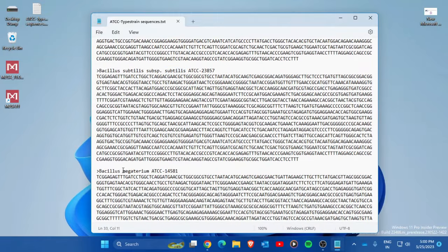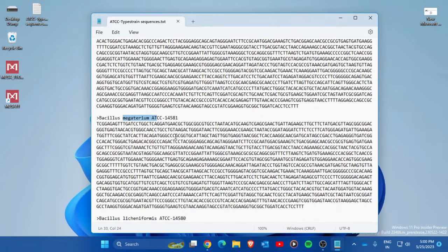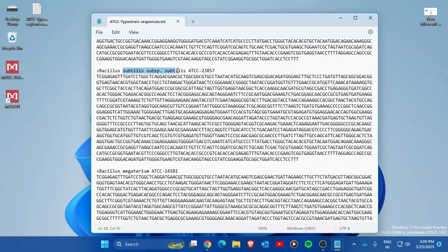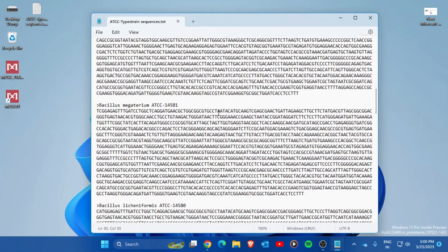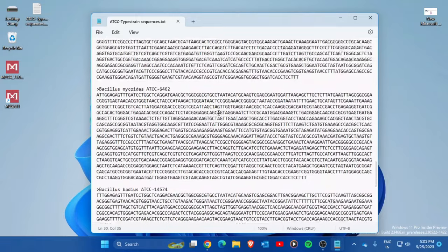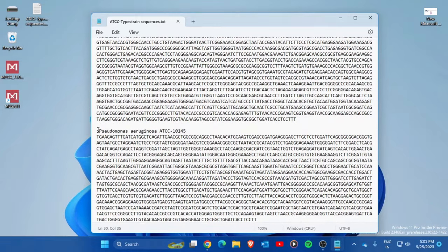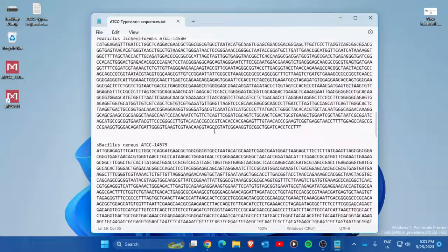Scrolling further, you'll see Bacillus megaterium and other organisms. All the sequences in this file are from different species but the same genus — Bacillus — with different species and subspecies. These are all type strain sequences of 16S rRNA. At the end, I have kept one sequence of Pseudomonas aeruginosa, which I want to use as an outgroup in the phylogenetic tree.